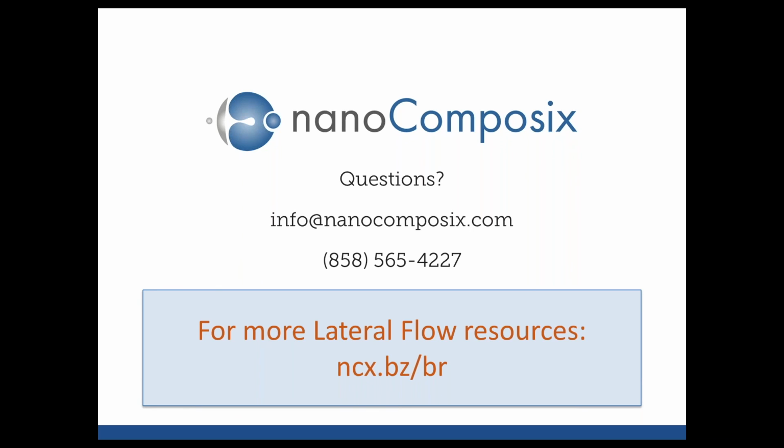This question comes from Tim. Is it better to pre-treat a sample pad by immersing or by direct dispensing?